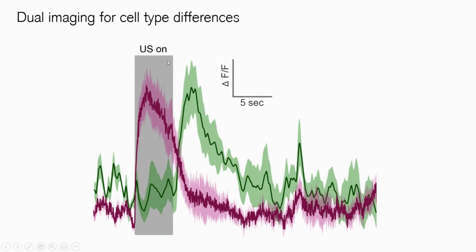And here you can see that when I deliver the ultrasound, this one cell type responds really strongly, very immediately. These are GABAergic neurons. And they may actually suppress the activity of these dopaminergic neurons, because this response doesn't start to happen until after the ultrasound is off. I'll give you the forewarning: there are really crazy, interesting interactions between cell types all across the brain.